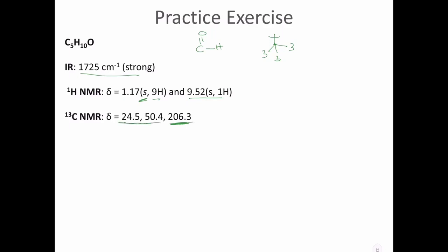Here we have a variety of stuff. We don't really need to care much about that. I just told you guys that for sigma single bonds, we will have them at between 0 to 90, or about below 100, including the triple bonds.